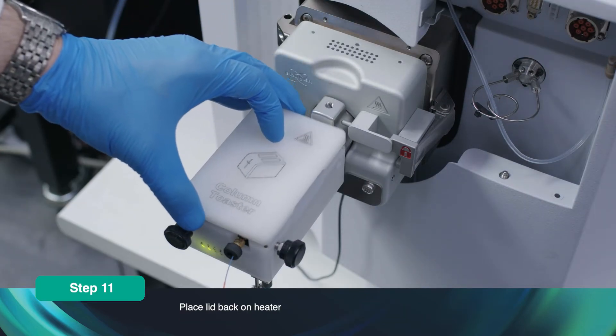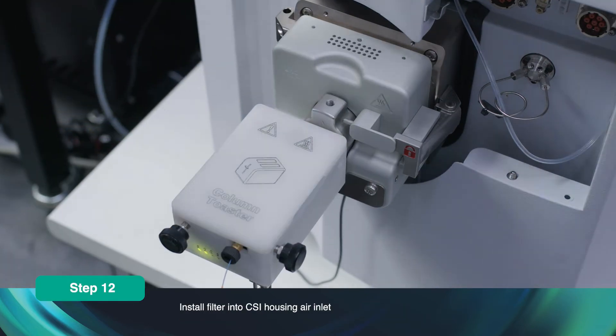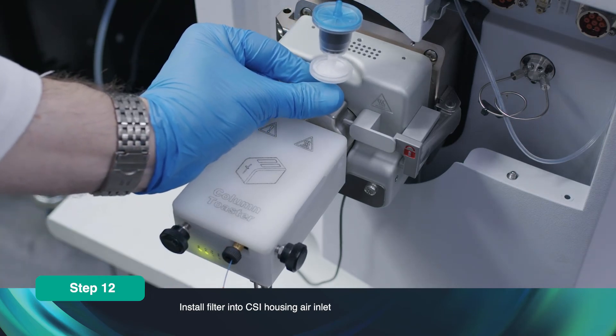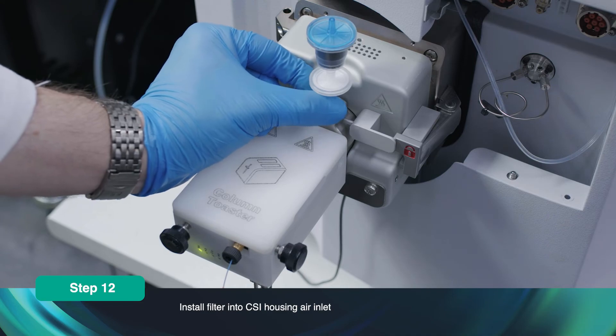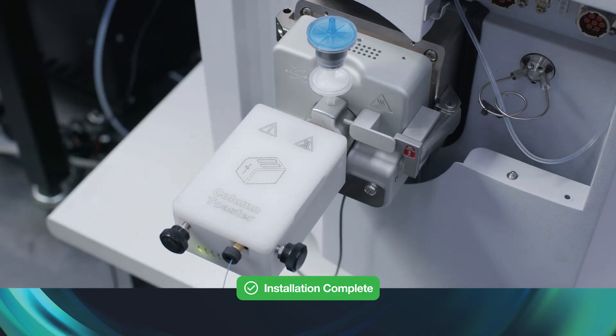Place the lid back on the heater. Install the filter into the CSI Housing Air Inlet. The column is now installed in the heater and ready for operation.